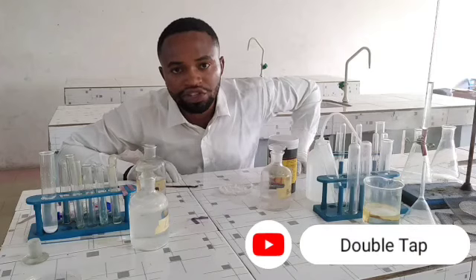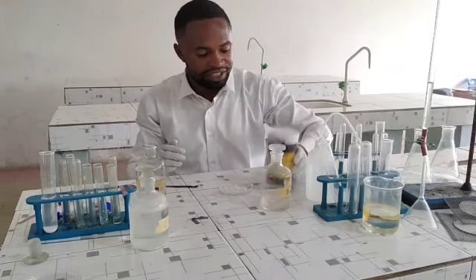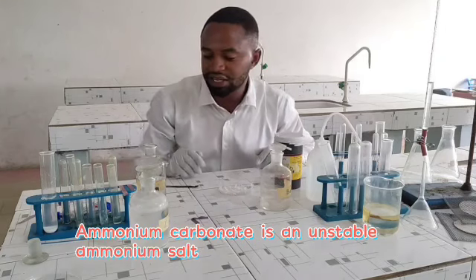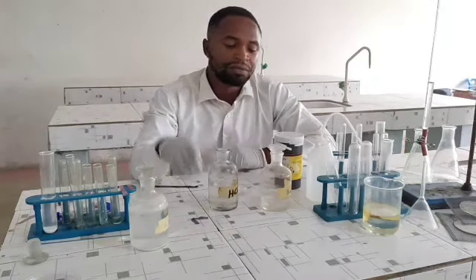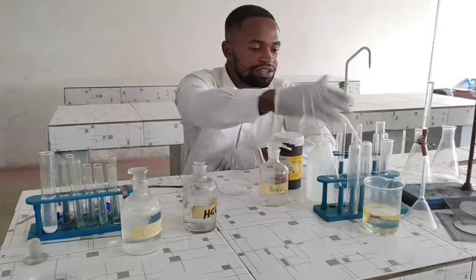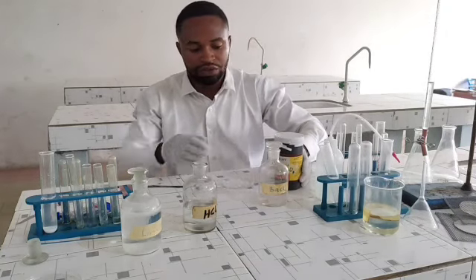Now, today I'll be taking you through the inorganic aspect of the chemistry practicals for NECO 2021. The white paper is out and the salt required for analysis is ammonium carbonate. Here's the salt. For us to carry out this analysis, we need reagents such as dilute hydrochloric acid, barium chloride, lime water, concentrated hydrochloric acid, and distilled water. I have all my reagents here with me. Now, this is the salt.